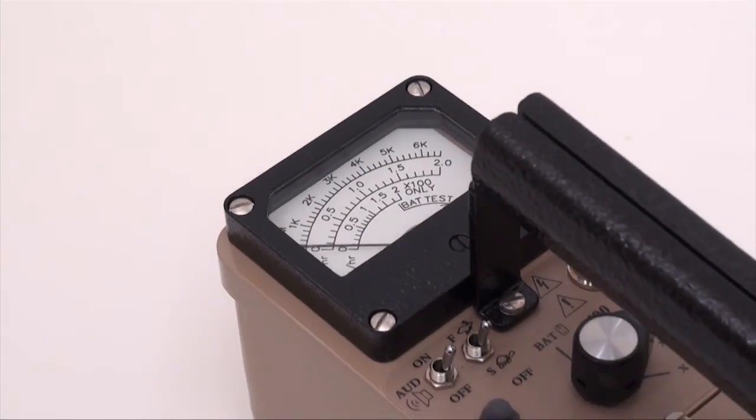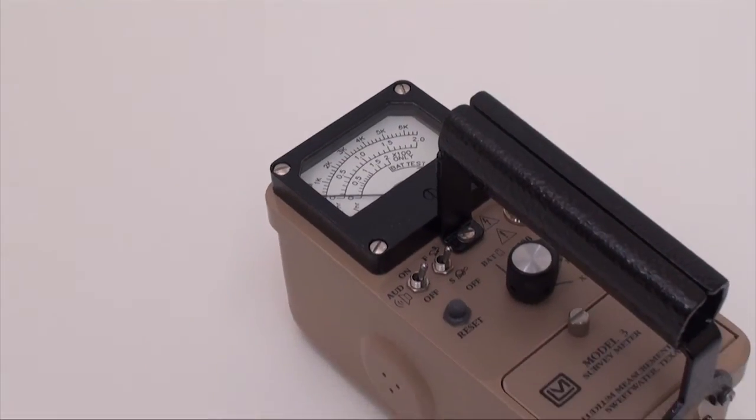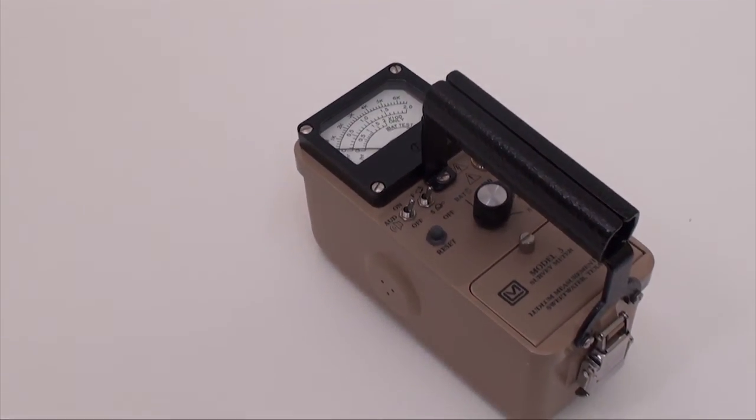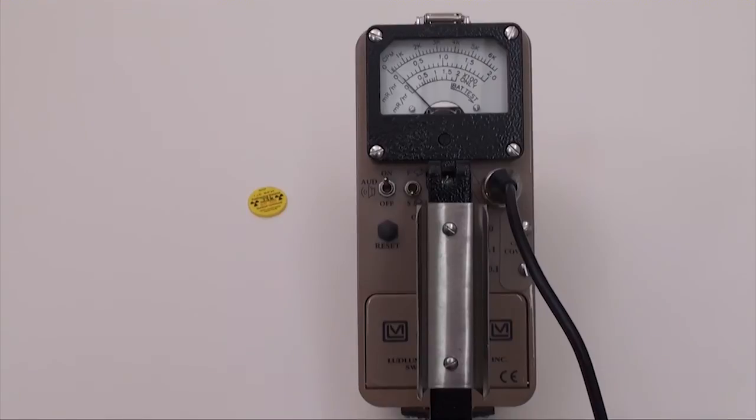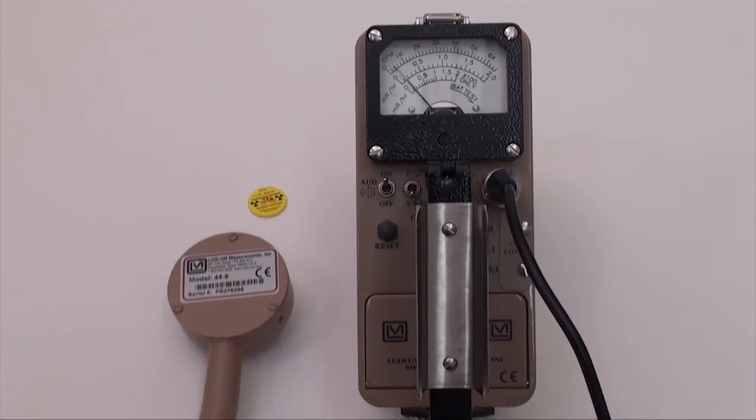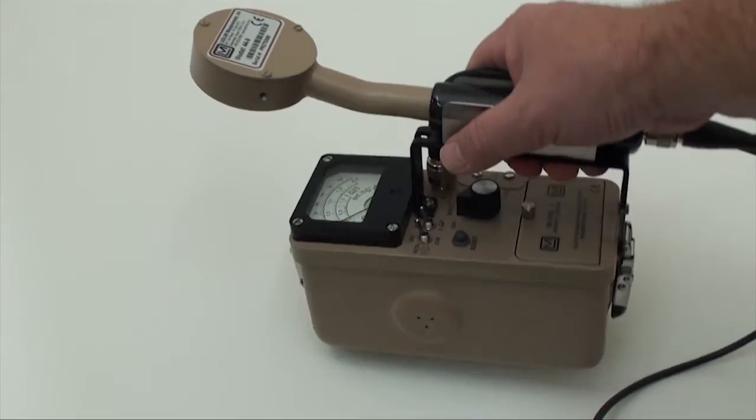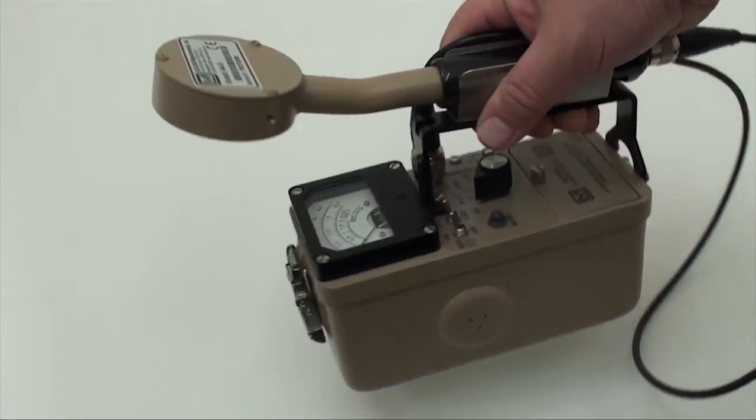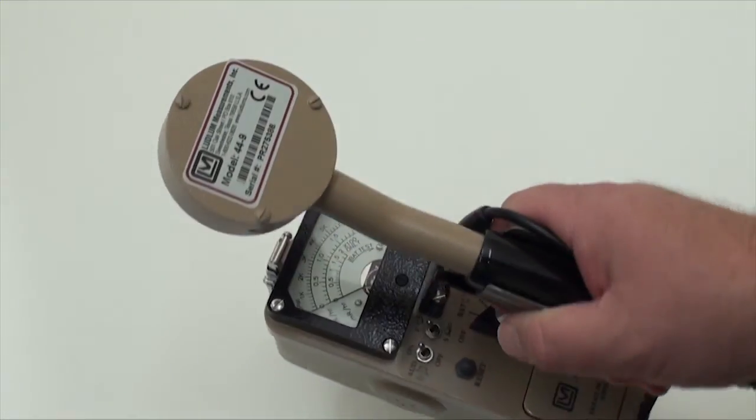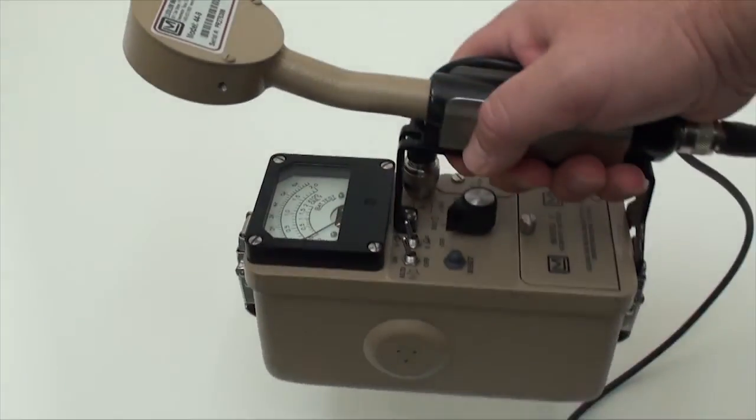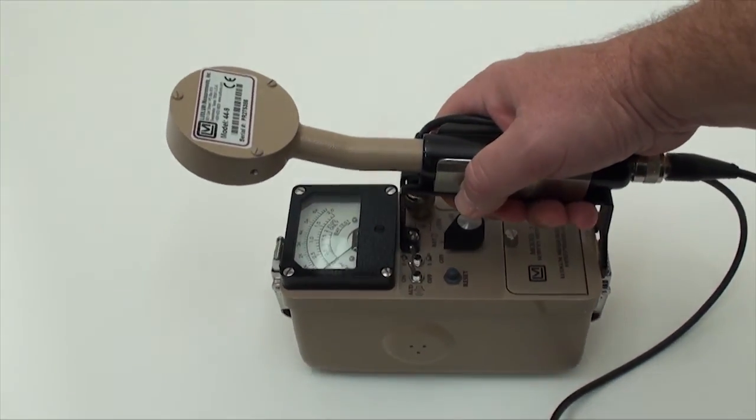In conclusion, Ludlum's Model 3 may very well be the most popular radiation survey meter ever produced. Its long-time reputation for reliability, durability, and longevity coupled to its versatility and affordable price make it hard to beat. If you're looking for a real tough radiation survey meter that is simple to use and is always ready to perform whenever and wherever you are, the Ludlum Model 3 is an excellent choice.